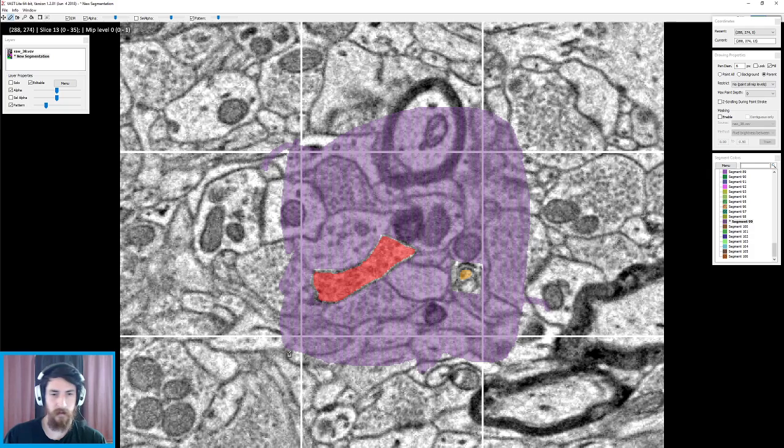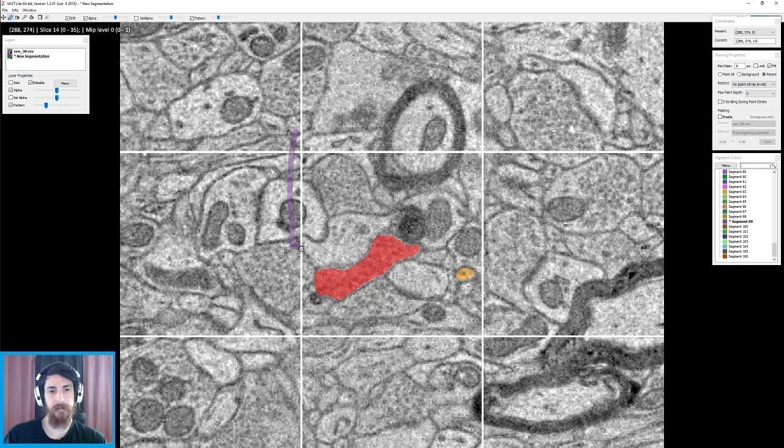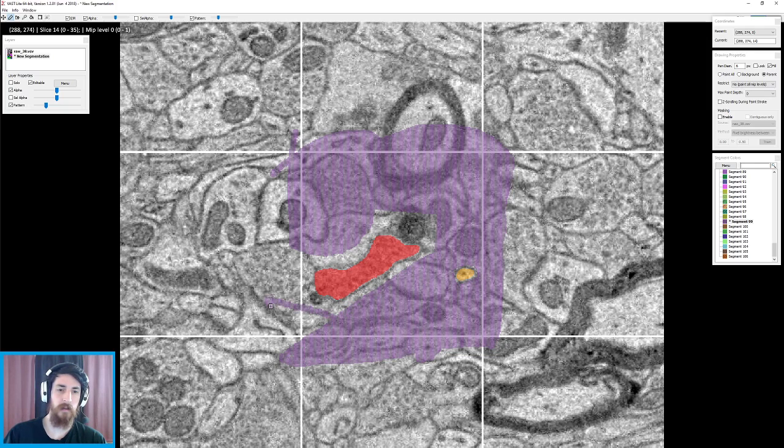Okay. Here we go. What do we think? This needs some more, obviously. Yes, indeed. Get that a little bit backed up. Okay. What if we did this one first? Could do that. Nicely done.